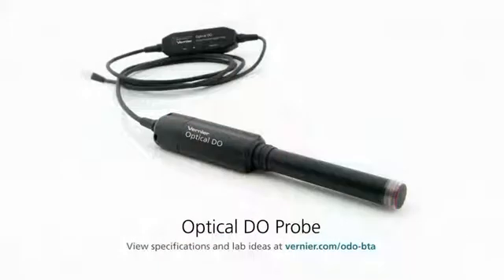Vernier now offers two choices in dissolved oxygen probes: the dissolved oxygen probe and the Vernier optical DO probe. The dissolved oxygen probe is slightly less expensive, but requires several setup and calibration steps. The optical DO probe may cost a little more, but it's virtually plug and play.